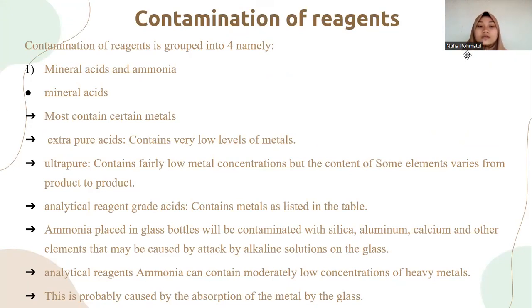Ultra-pure contains fairly low metal concentration, but the content of some elements varies from product to product. Analytical reagent grade acid contains metal as listed in the table.